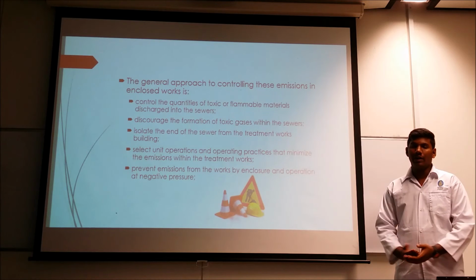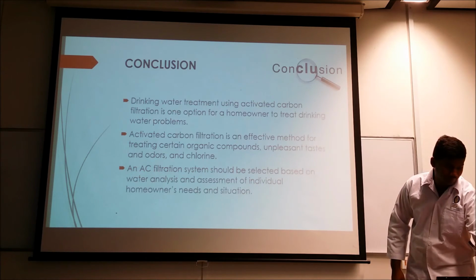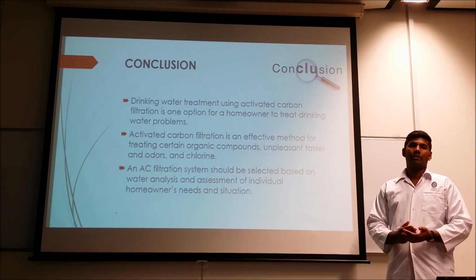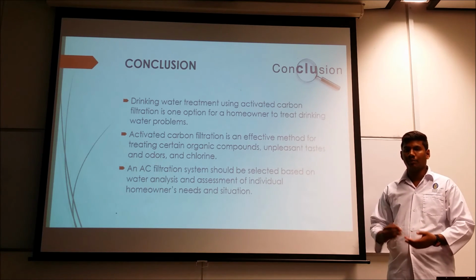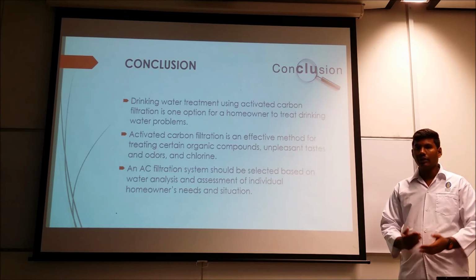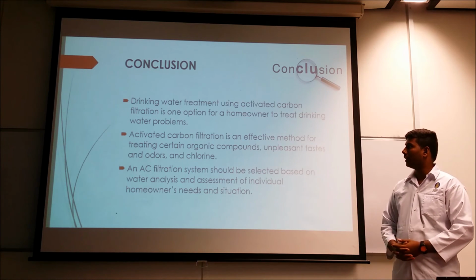So finally, we have come to the last part, which is the conclusion. Activated carbon is able to give clean water, but not only activated carbon; we also need other substances, as previously mentioned by my friend in the video just now. Activated carbon is able to do drinking water treatment.